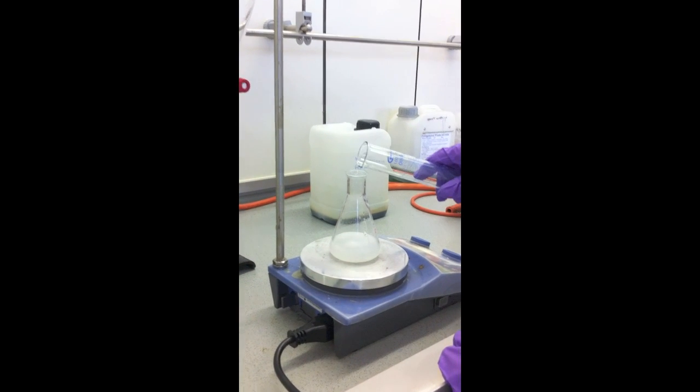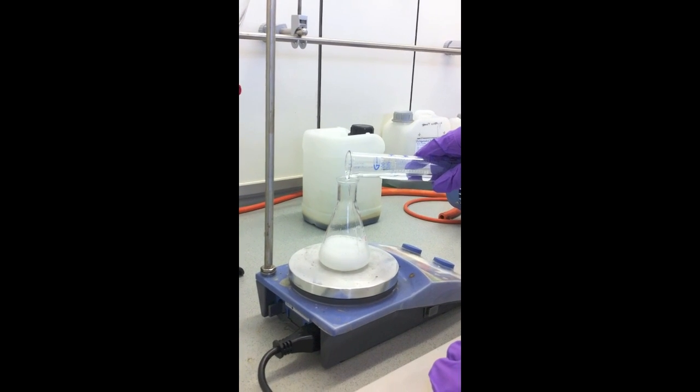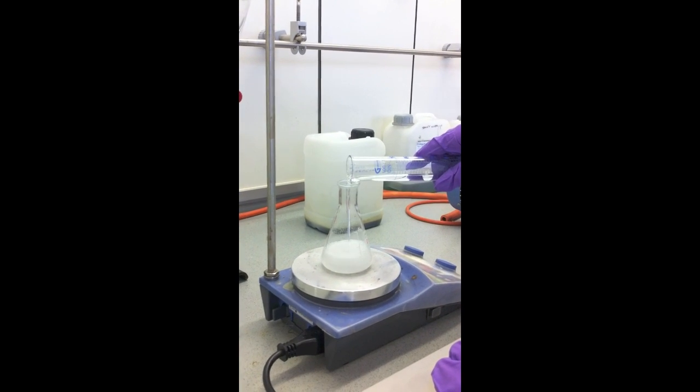About 30 ml of hydrochloric acid was added to the solution to neutralize any remaining sodium borohydride. The reaction gives off hydrogen, which is why it foams.